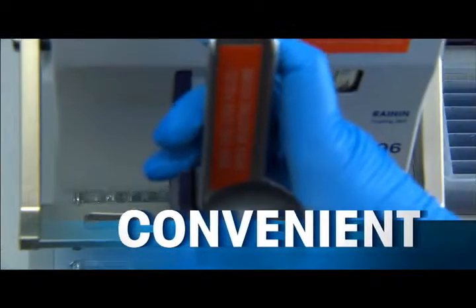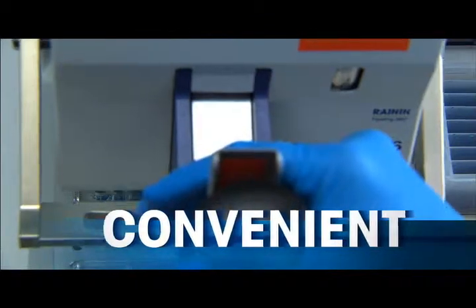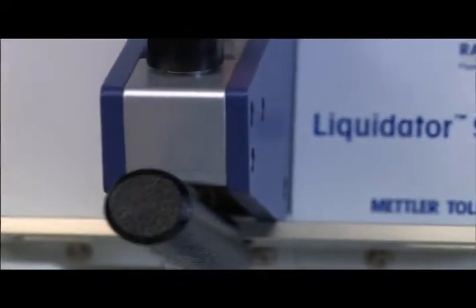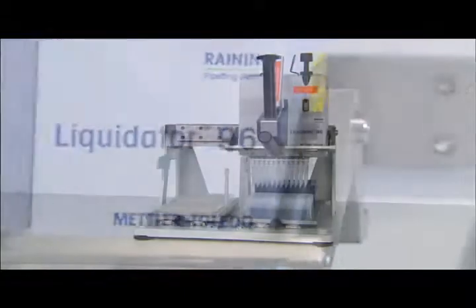Convenient, no programming, no electricity, no complicated robots. For a wide range of applications, the Liquidator 96 manual benchtop pipetter.